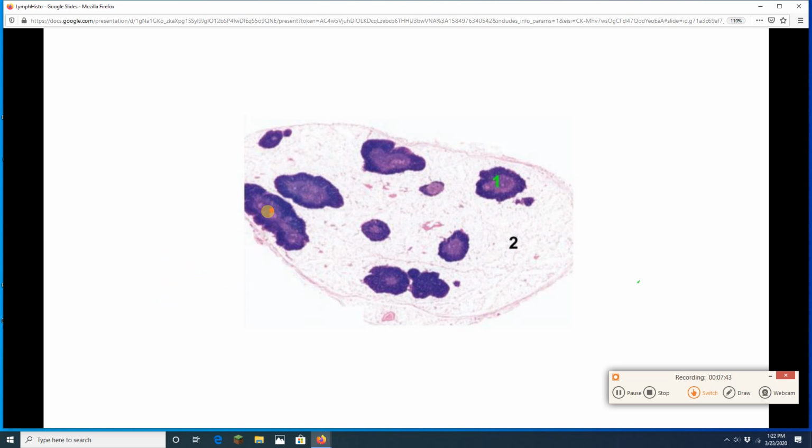This is the adult thymus. There are still islands of purple tissue. So the adult thymus is not totally nonfunctional. It just is not as big and as lymphocyte rich as the infant thymus. Now what I also see here is a lot of adipose tissue. Basically, the thymus gets more fibrous and fatty as life proceeds, as you get older.